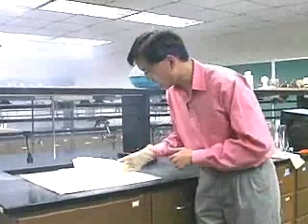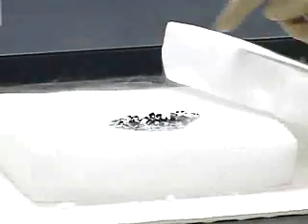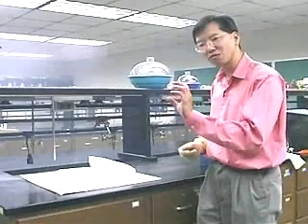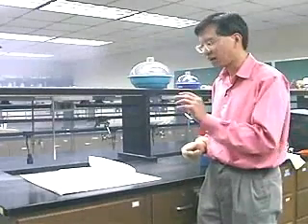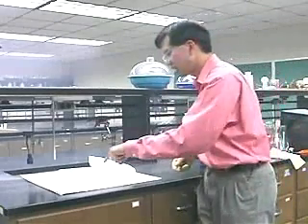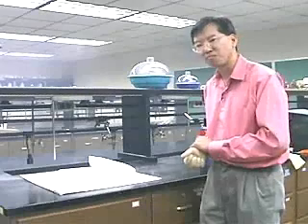Okay, now, if you take a close look at this, you'll see a bunch of black stuff sitting on top of the white stuff. Well, the white stuff is magnesium oxide, MgO. It's a white solid. But right in the middle, there's also a bunch of black solid. And that black solid is graphitic carbon. So the carbon dioxide was actually converted into carbon, and the oxygen was removed by the magnesium. And the magnesium then becomes magnesium oxide, and the carbon dioxide goes all the way back to carbon. So it gets reduced all the way to carbon, and that's the evidence right here. You can see the black graphitic solid.